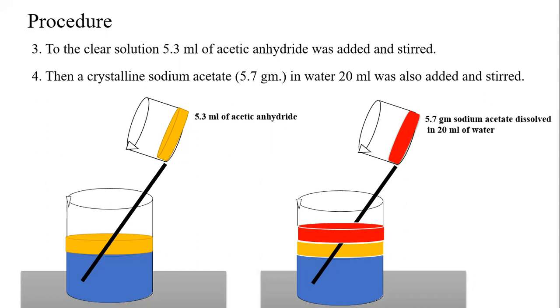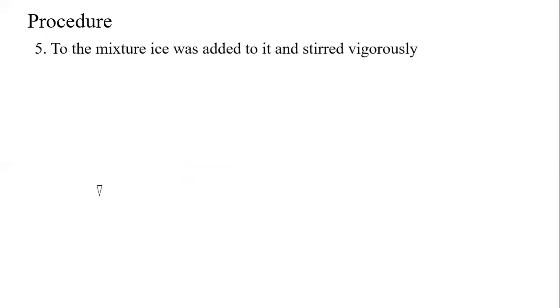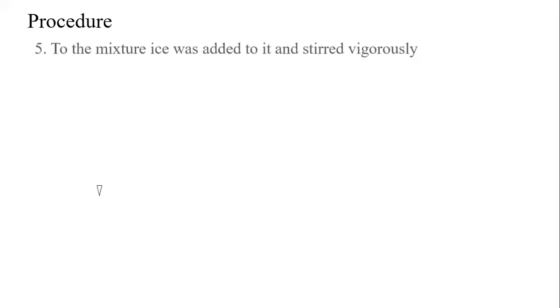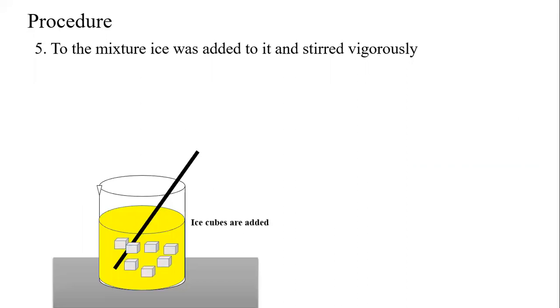That is the mixture of aniline, HCl, and acetic anhydride. To the same beaker we will be adding 5.7 g of sodium acetate dissolved in 20 ml of water and will keep on stirring. To the mixture, after the stirring, we will add ice cubes to it and continue the stirring.